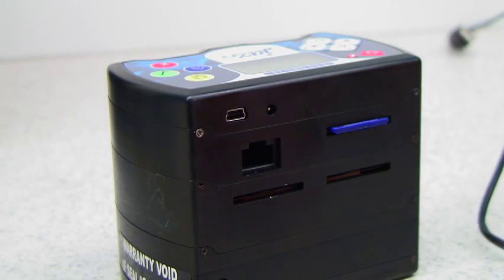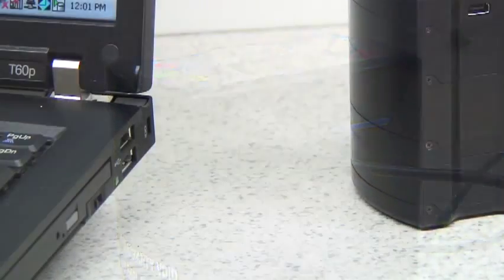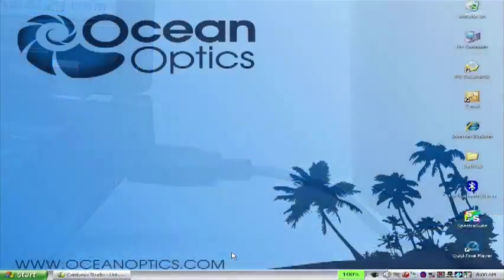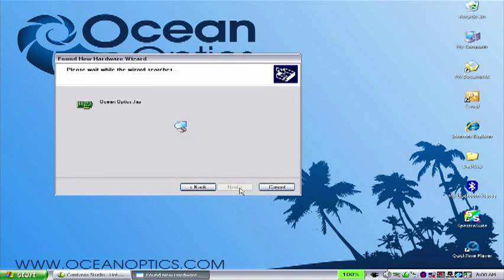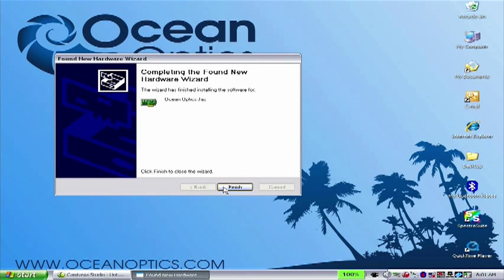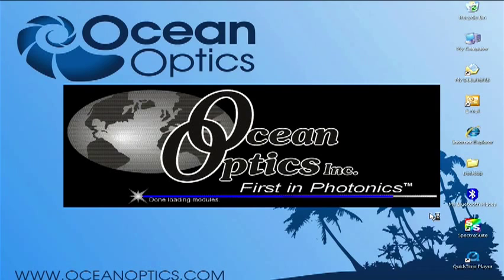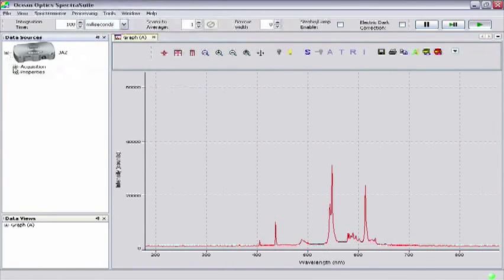Connecting your JAZZ to a PC is easy. To directly connect, plug the Mini-USB side of the cable into the back of the spectrometer, and plug the USB side of the cable into your PC. A 'Found New Hardware' message should appear once your JAZZ is connected and turned on. Select 'Install Software Automatically' and then click Next. After a few moments, the process will be complete and the wizard will alert you that your spectrometer is ready to use. Click Finish. You are now ready to use Spectra Suite software. In Windows, simply click on the Spectra Suite icon to run the program. Once it starts, point the JAZZ's aperture at a light source and notice the spectra change.